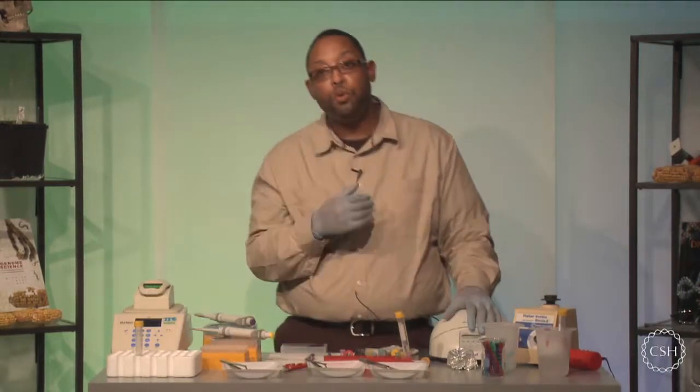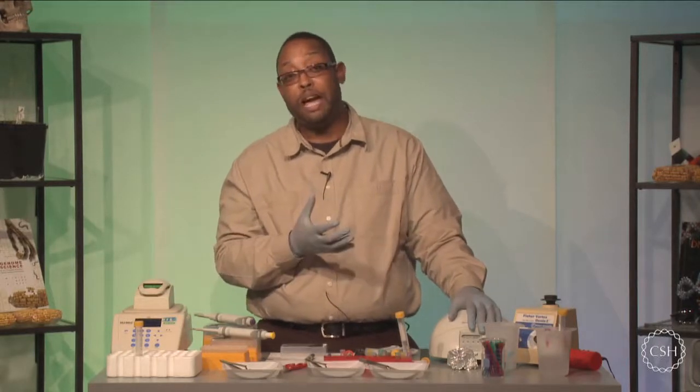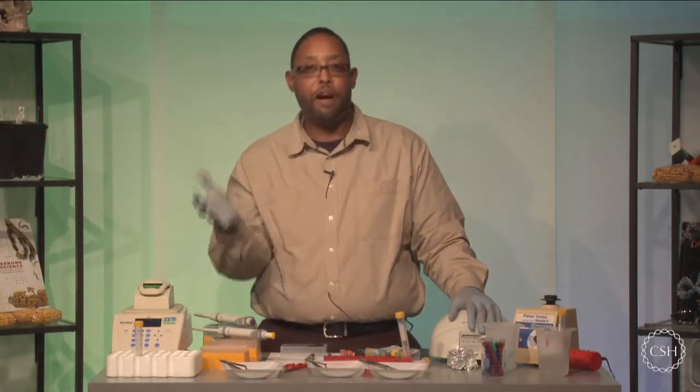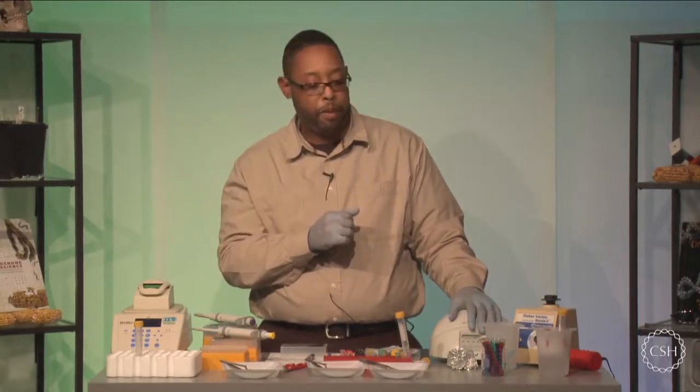And what we're going to do is remove the supernatant. By removing the supernatant, we're removing large amounts of contamination that would be present. But then we're going to follow that by some washing steps, which should remove excess contamination around the pellet as well.